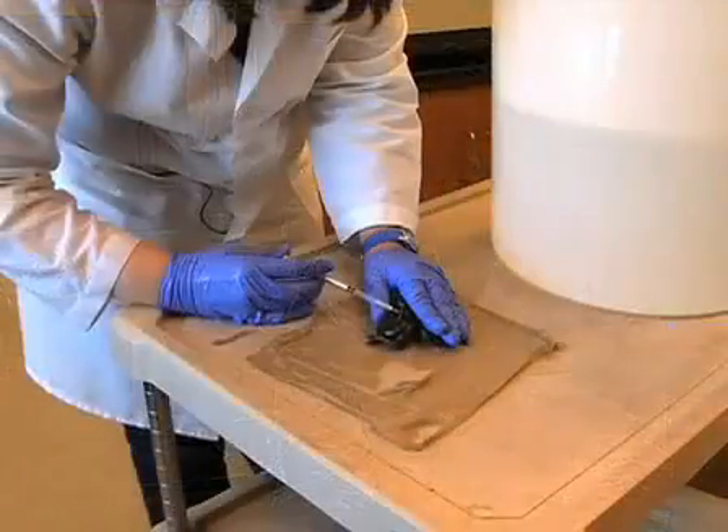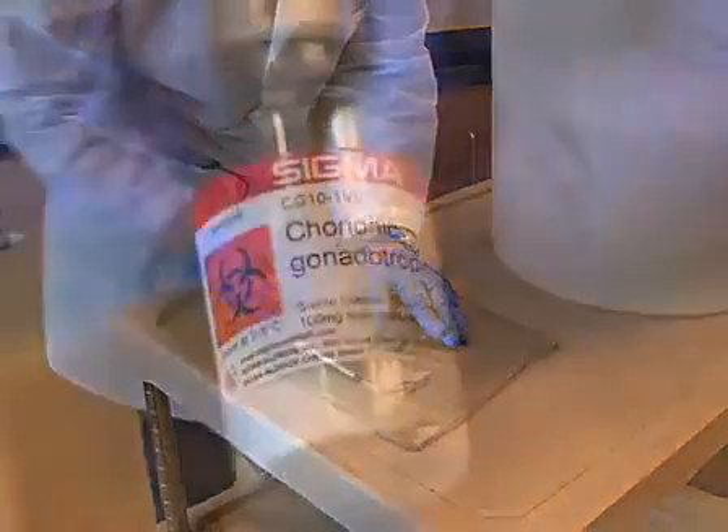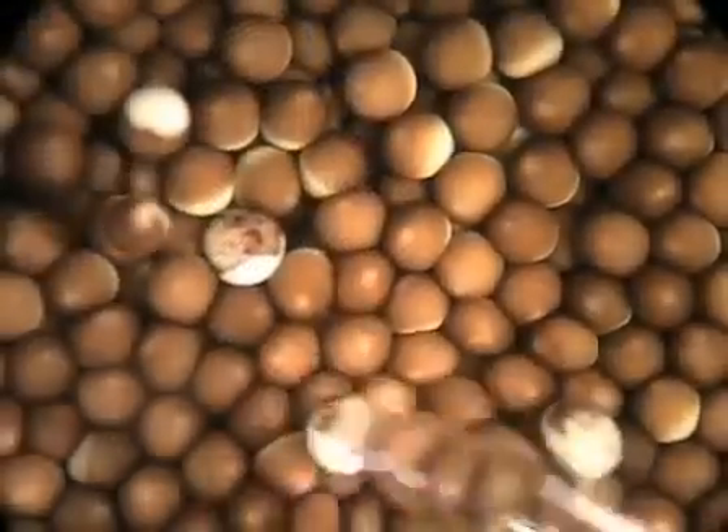This procedure includes the following steps: priming frogs for egg-laying with pregnant mare serum gonadotropin, inducing egg-laying with human chorionic gonadotropin, and sorting out any bad eggs or oocytes. So let's get started.